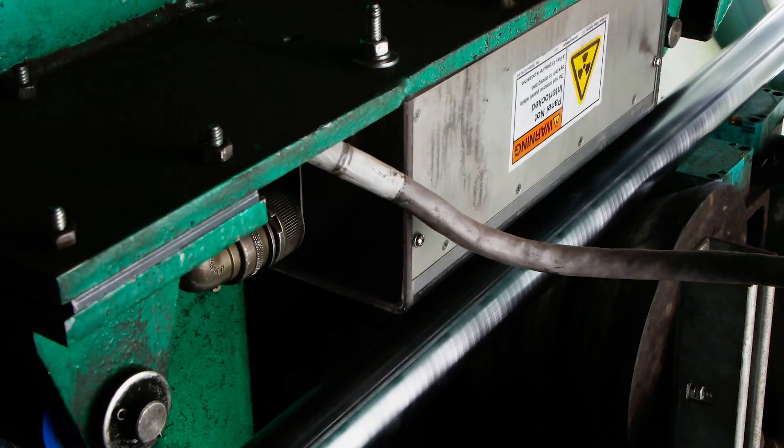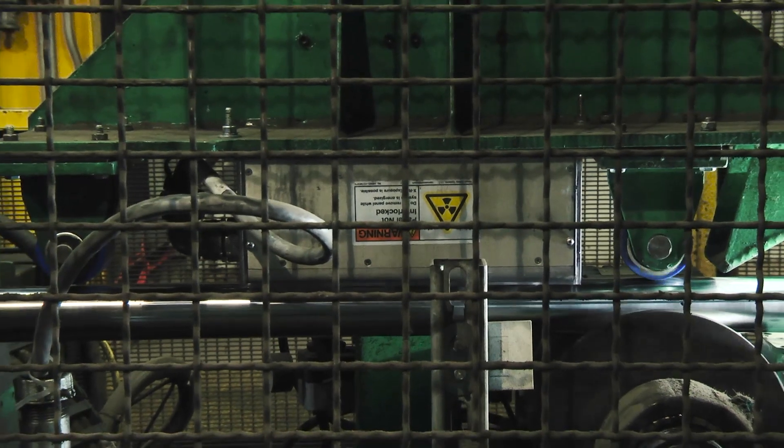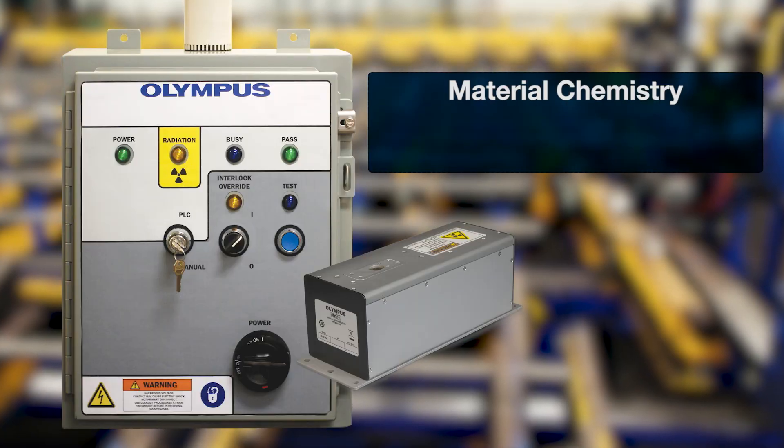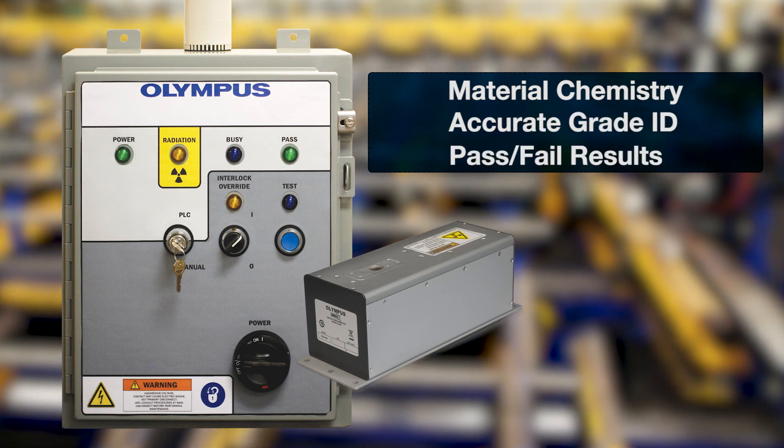The FOXIQ analyzer provides customizable, continuous measurements of titanium to uranium on any surface, and can deliver results in the form of material chemistry, accurate grade identifications, or pass-fail results.